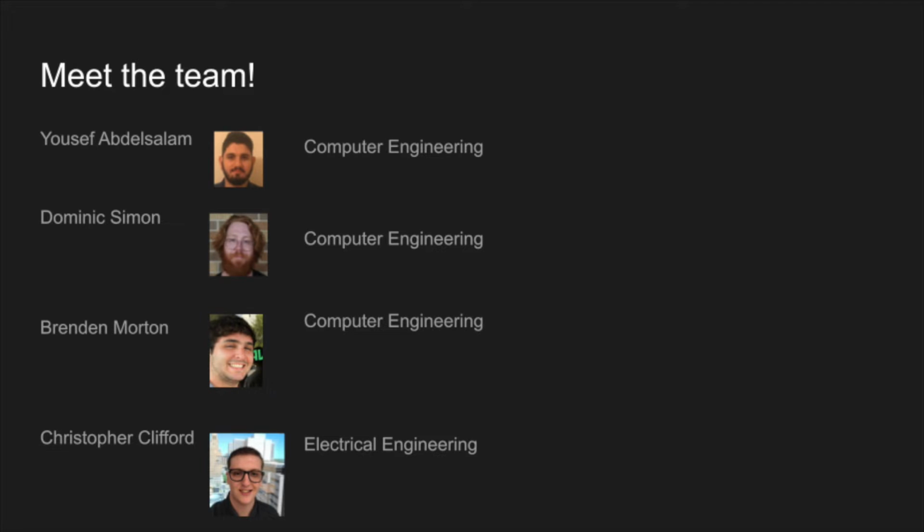Hi, this is the team breakdown of Group H. We have three computer engineers. The first is Yusuf, then we have Dominic, we have Brendan, and then our fourth member, Christopher, is our EE.